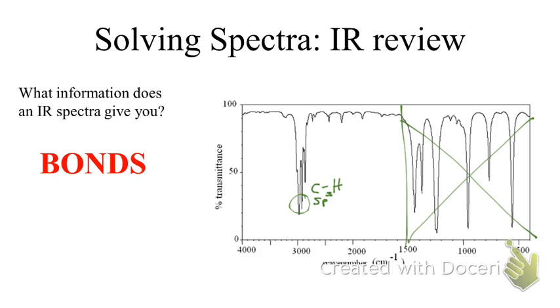After you solve the structure, if you want, you can always go back to the IR and try and process that fingerprint region a little bit more carefully, but that's up to you. Okay? So as far as analysis and getting points, this is all we really get out of the IR.